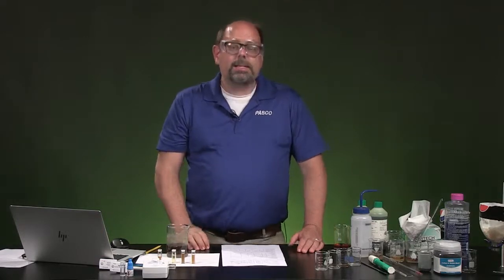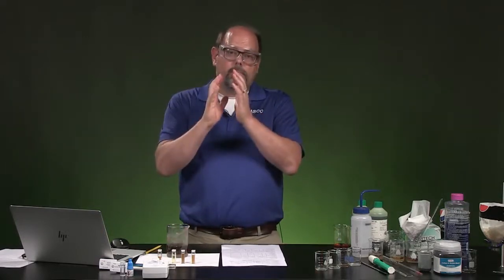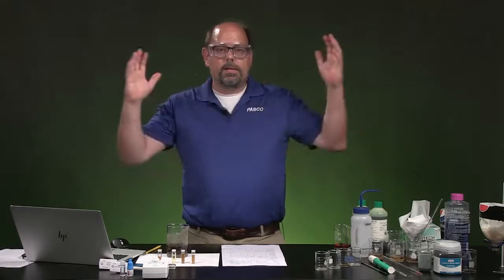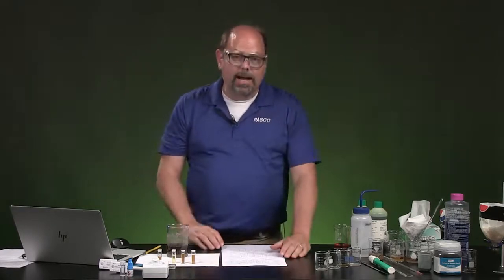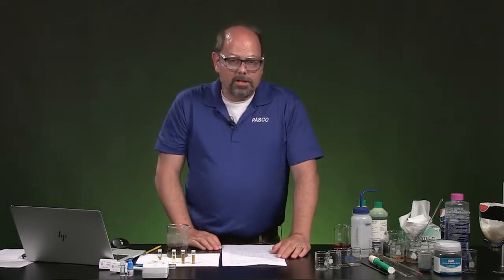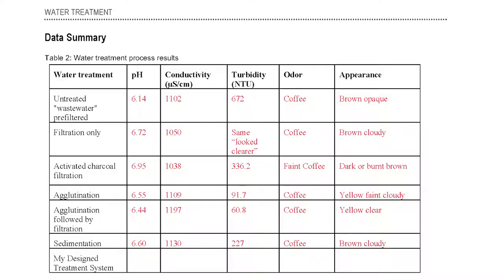Now, the turbidity is getting out larger particles. Molecules that go into solution are surrounded by water, molecule by molecule. The bigger parts that make turbidity are actual large particles that have maybe tens of thousands of atoms or molecules large. And here we see what takes these out the best.